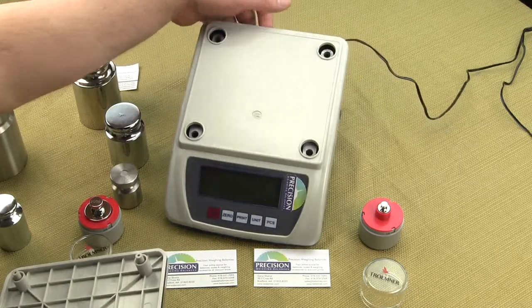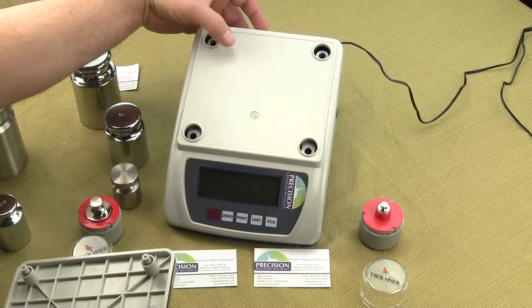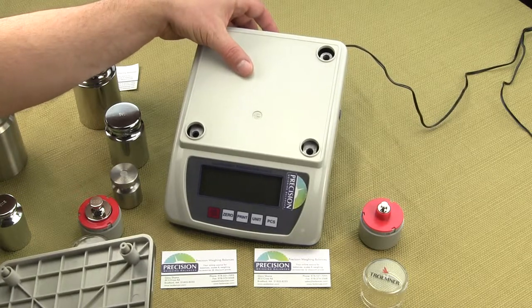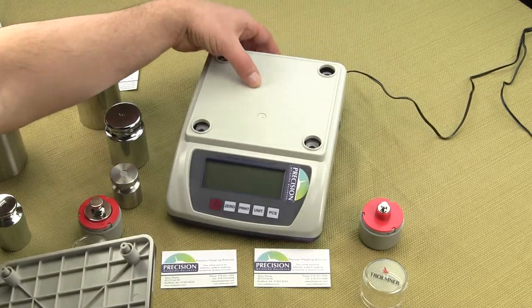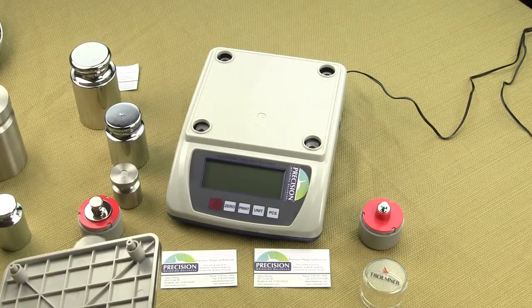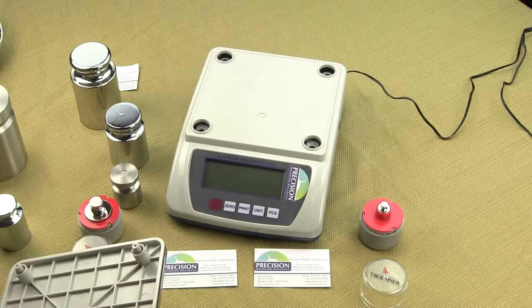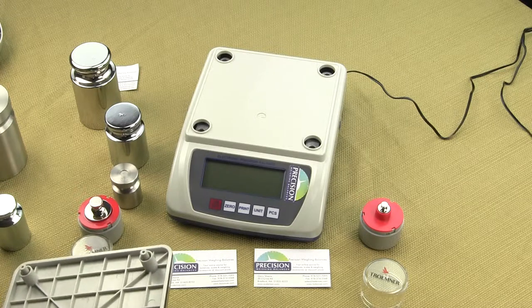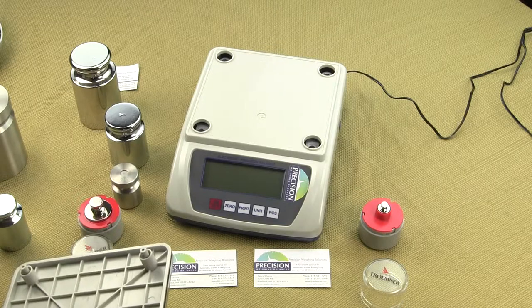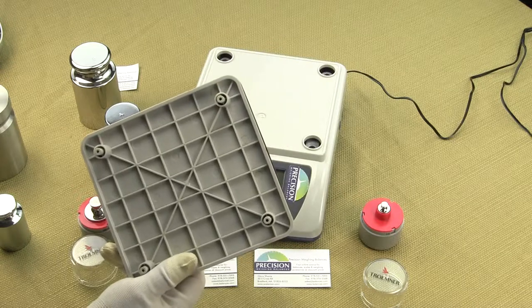Beneath the platform, there is a spider that the subplatter fits into. But if you have the weighing platform removed, there would never be any excessive loads or pressure exerted on the load cell. If you're a scientist in the field taking samples and you have a scale in a bag or case, any pressure applied to the platform could cause premature failure of the weighing sensor. With the EPB, simply remove the weighing platter and this eliminates any possible damage.